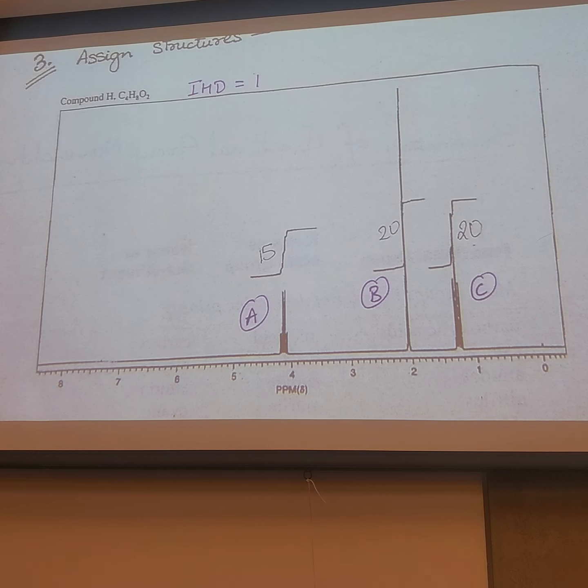Okay, cool. So now, knowing that there are only 8 hydrogens in the molecule, we have to get a little creative. Suggestions, how could I adjust these integration ratios so they total 8? 2, 3, 3. If I made this 2 hydrogens, and remember it's 1.3, what if it's actually supposed to be 1.5?